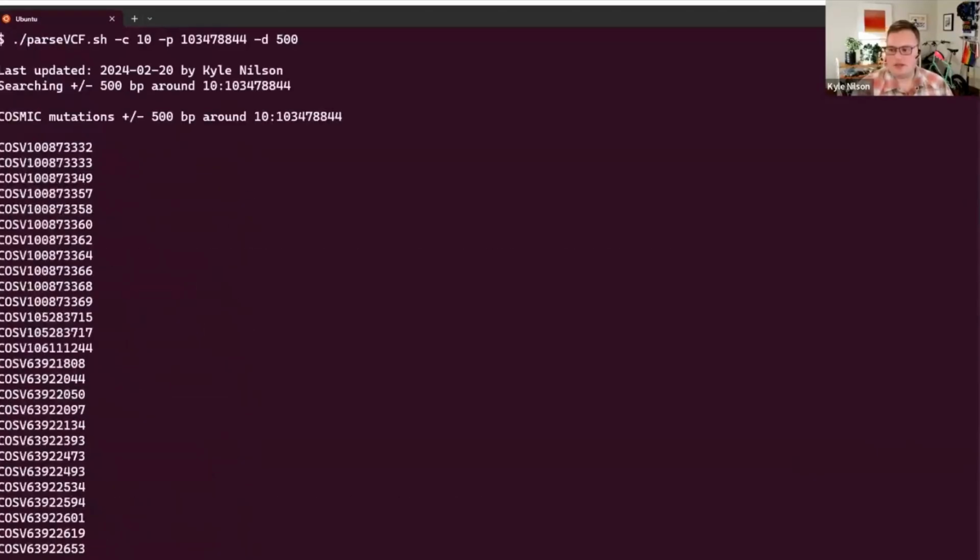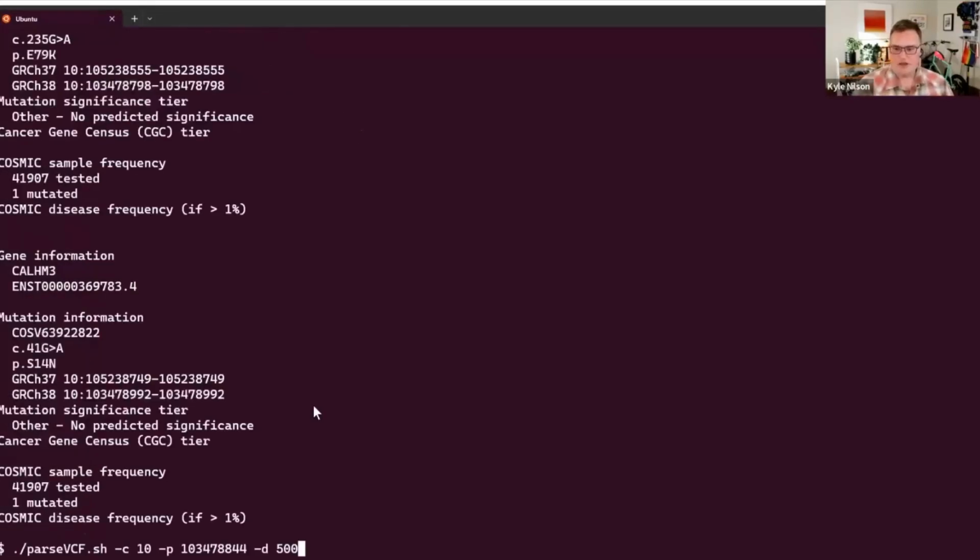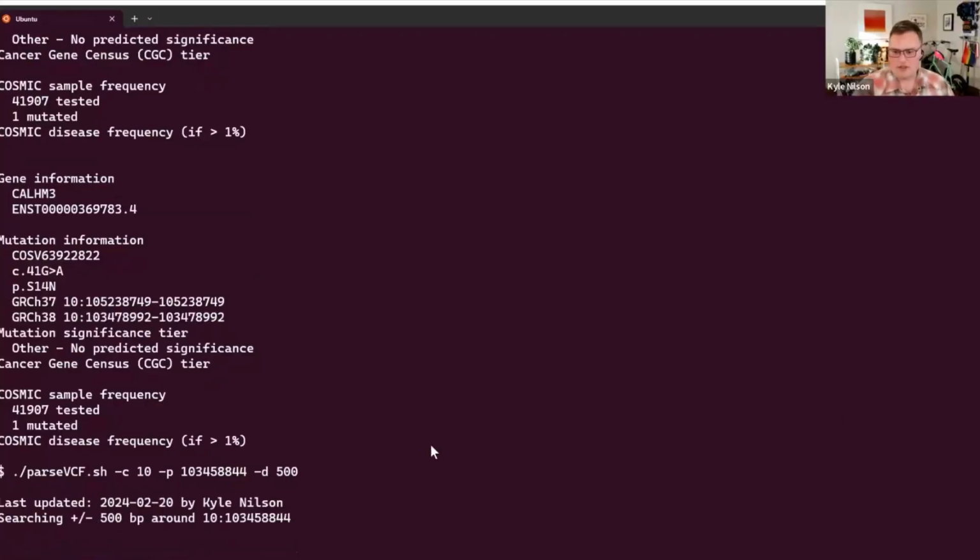But in addition to these specific windows, because it is possible to look in other genomic regions, you can determine fairly easily whether there are different locations that might be more ideal. So for example, if I look 20,000 base pairs away, I can go ahead and search for this new window just to see how many variants are present here.